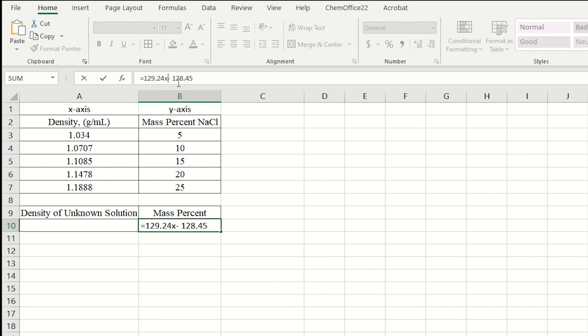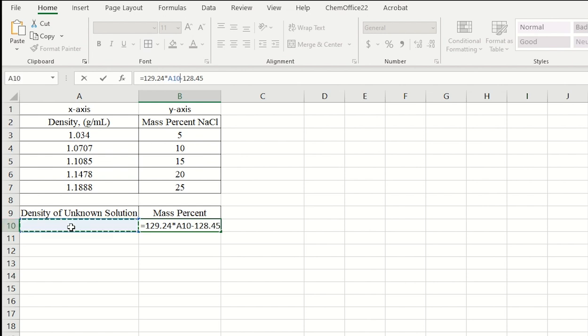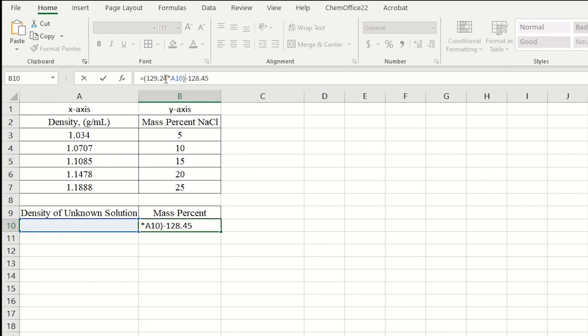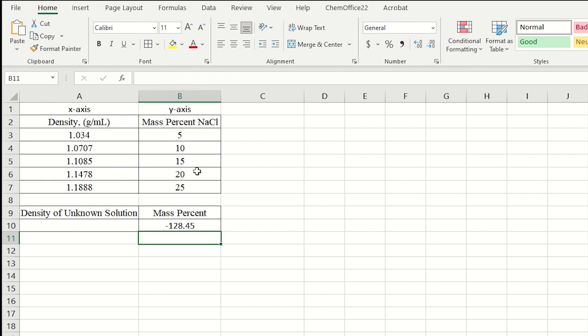I'm going to take out the spaces. And right here for X, I'm going to plug in times this cell right here, the density of the unknown. So this cell number 10 here, I'm going to plug that in. And I'll put this in parentheses. Looks like that. And I'll press enter.